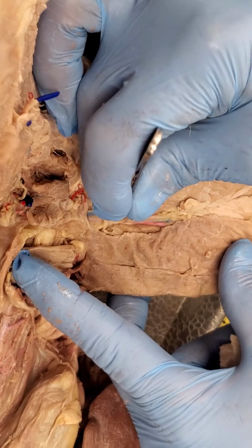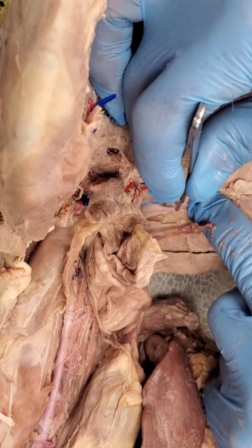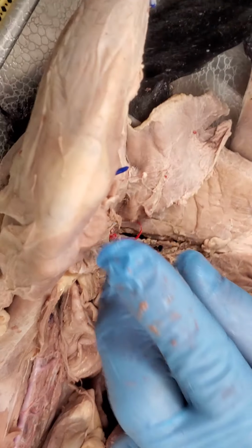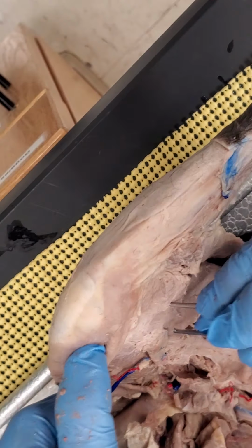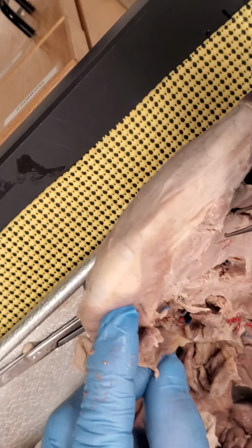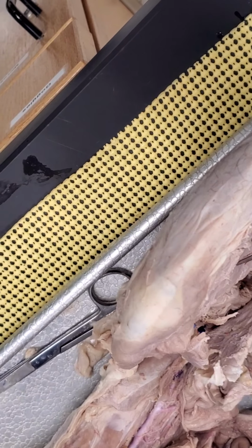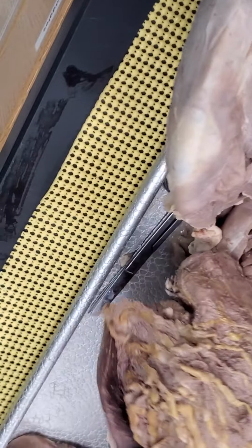You can see right here, somewhere in that nerve. There it is. Femoral artery, femoral vein. Again, the saphenous has been damaged. It would be coming up here and going to the femoral up here, but all the anatomy 1 people destroyed them. I see no saphenous veins on these 2. Veins, just like before.